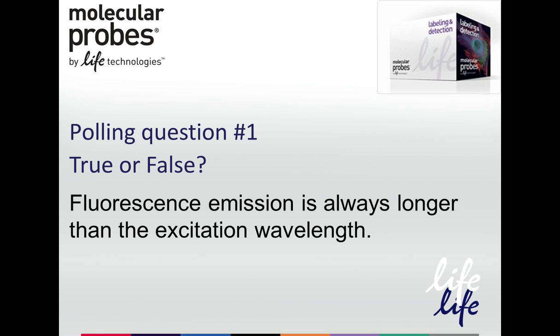So we have our first polling question. This is a true or false question, and you can answer as soon as you're ready. True or false? Fluorescence emission is always longer than the excitation wavelength. You can vote right now. I'll give you a few more seconds to respond.